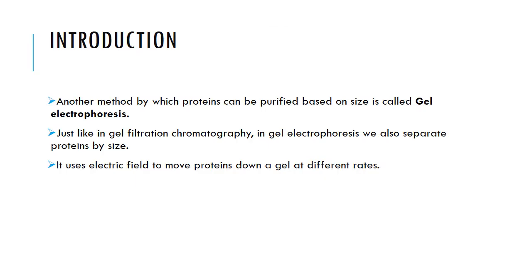So let's have in mind that when it comes to gel electrophoresis, we are dealing with a method that we can use to separate proteins based on their sizes.